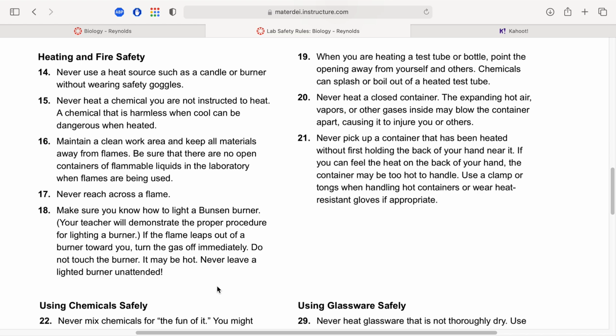Wash your hands is guidance for staying clean for the virus, but also keeps your materials clean. So wash maybe before you start the lab. Definitely wash after the lab. There's soap and towels hanging on the wall.